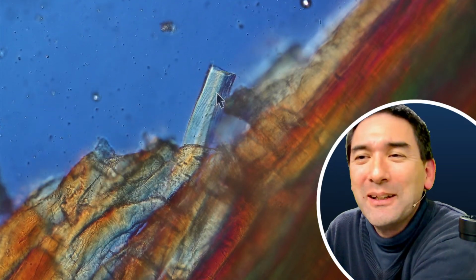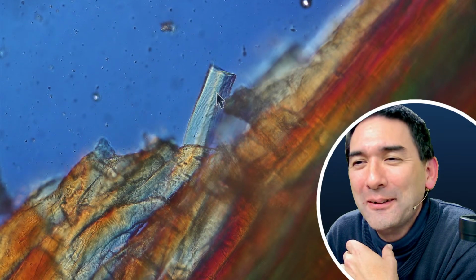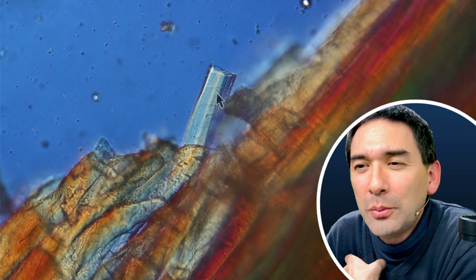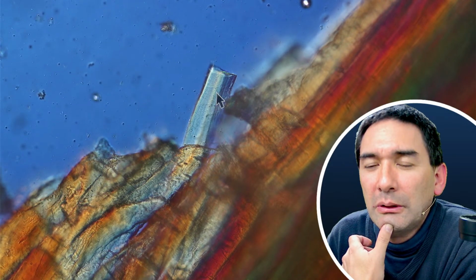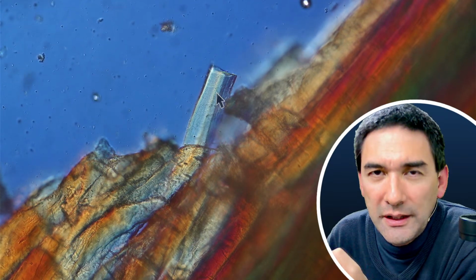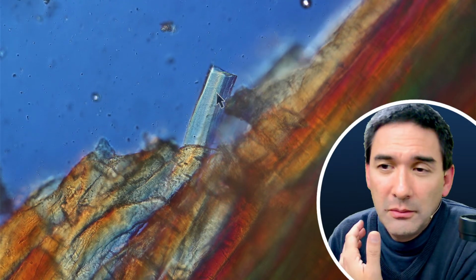Yeah. So I'm going to check again some of the comments here. Somebody told me to wash the blade in ethanol between the two cuts. What's the benefit of this? Good question. I don't know. I mean, if you wash the blade in ethanol, the ethanol is going to evaporate quickly, so it's going to be dry. So I don't know.